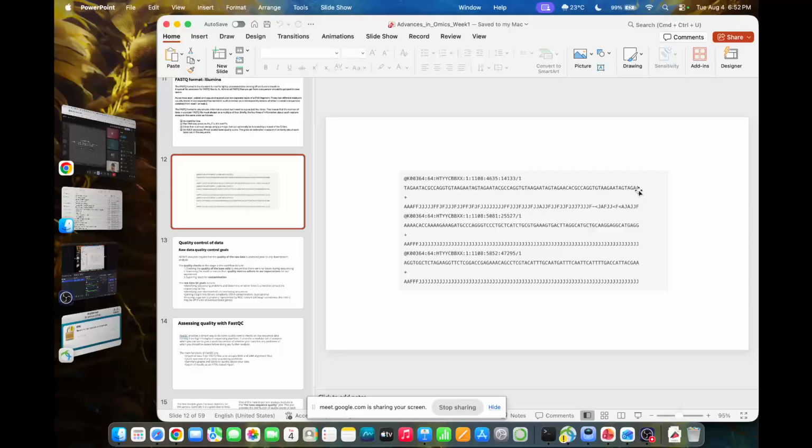Generally, what you get is this set of reads, these random sequences of reads. There will be multiple of these reads, and now you have to say where these reads have originated from in your own genome. Right. Doing that is quite difficult, and that process is known as alignment. So how do you do that? You take a reference genome. So what is a reference genome?